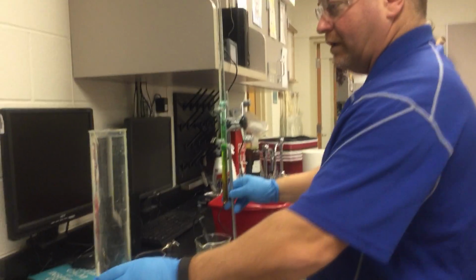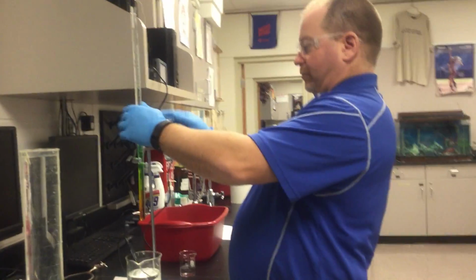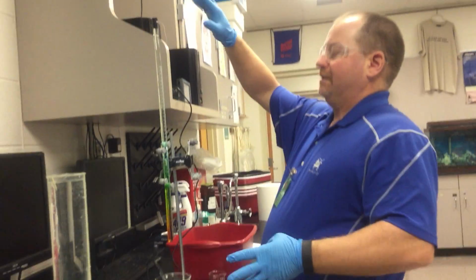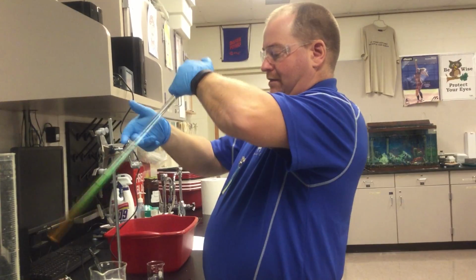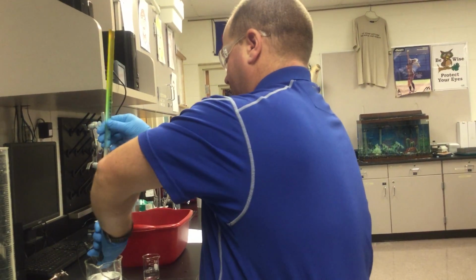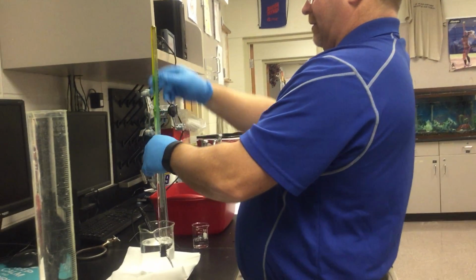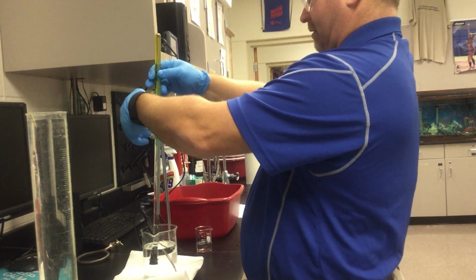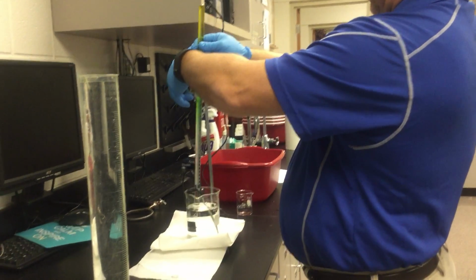Okay, what I'm going to do is simply take this, take her out of here, invert it, put it down into the water, as so. Clamp my tube in there.